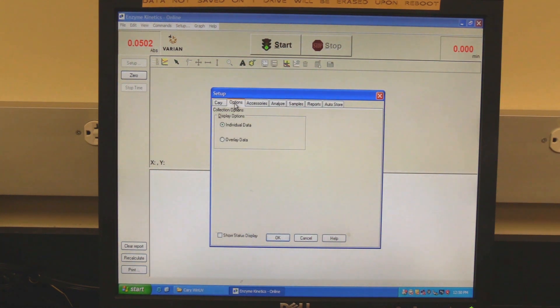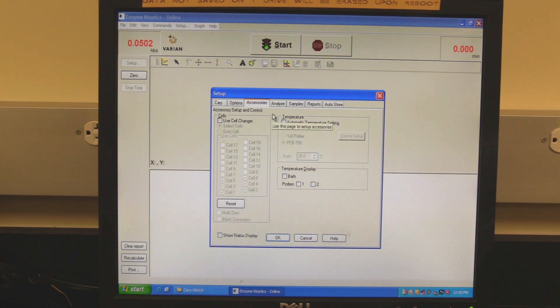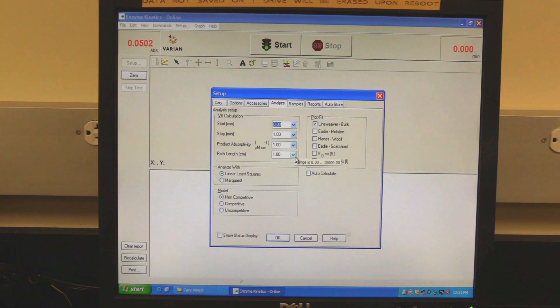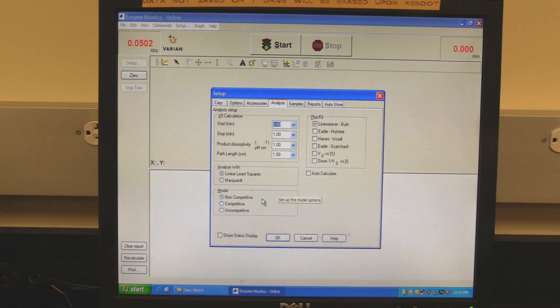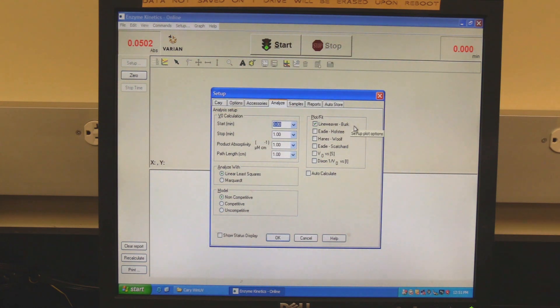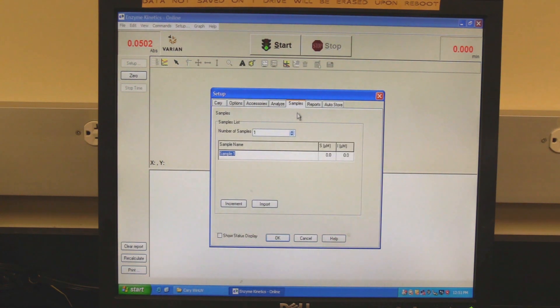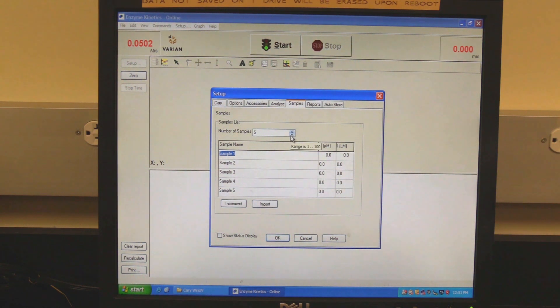Click on the Options tab. Set whether to display data individually or overlay. Click on the Analyze tab. In the V0 calculation, set the parameters used for the calculation. In Analyze Width, set your analysis method. In Model, set the type of enzyme reaction. In Plot Fit, select the desired type of plot. Check the Auto-Calculate box so the software will automatically calculate. Click on the Samples tab to set the desired number of samples. Click the Up arrow to increase or the Down arrow to decrease the number of samples.